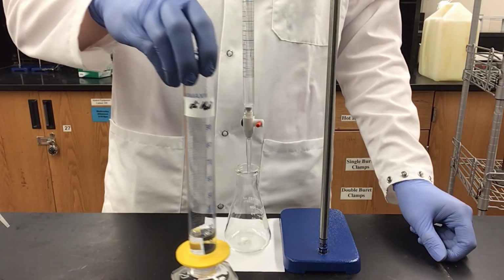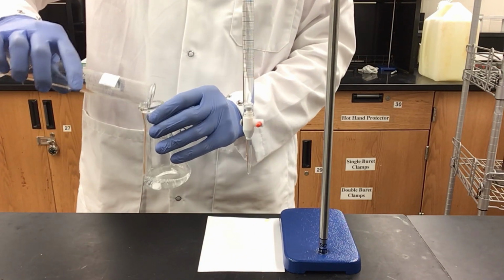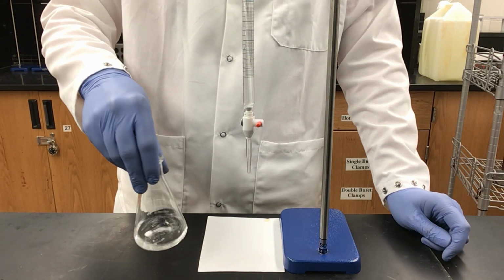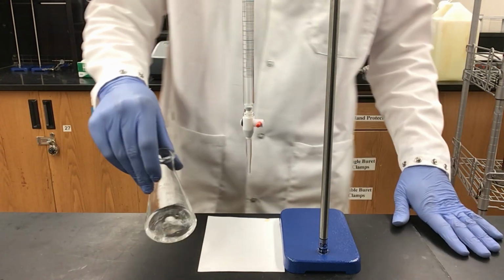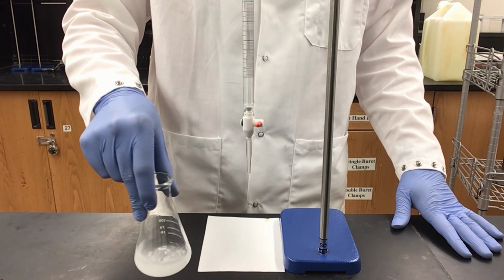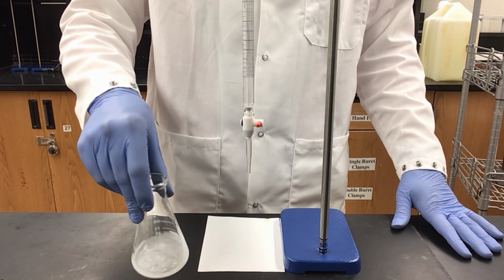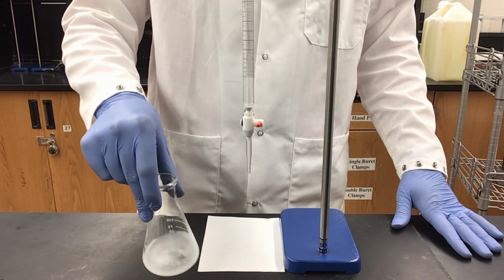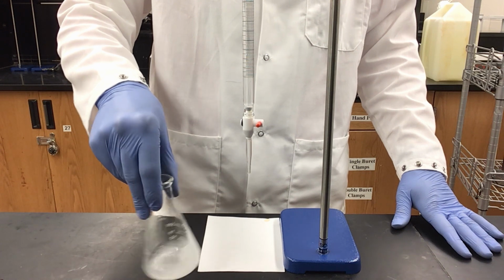I'm going to take 25 milliliters of DI water and add to my flask. And I want to swirl this until my aspirin tablet begins to crumble and dissolve. This can take some time. If you want, you can crush the tablet prior to adding it to your flask in a weigh boat. However, you want to make sure that you have pre-massed that weigh boat on a scale. That way you can see how much aspirin you have possibly lost as you crushed the tablet.